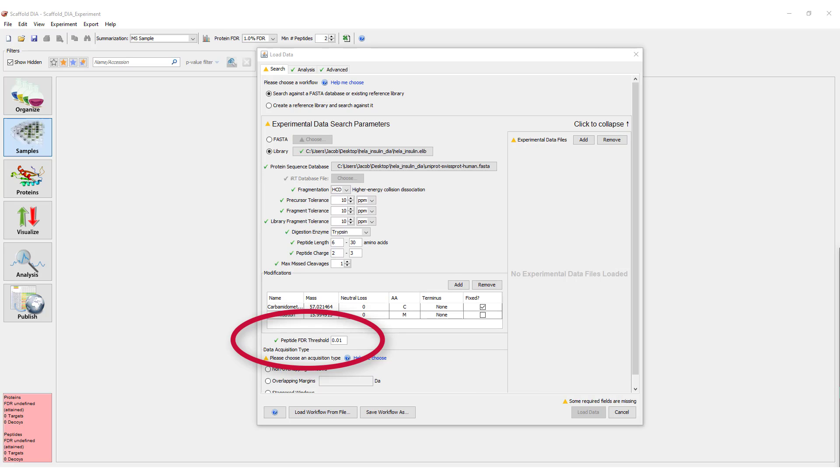Below the Modifications table, you will see a box for the Peptide Level FDR threshold with the default set to 1%. Setting this parameter to the desired FDR value is very important as this threshold cannot be changed once the data is loaded.